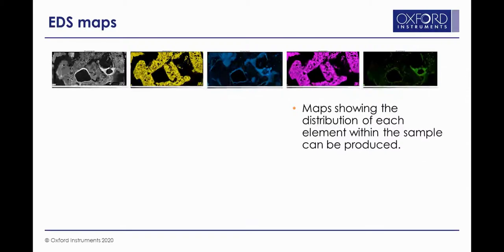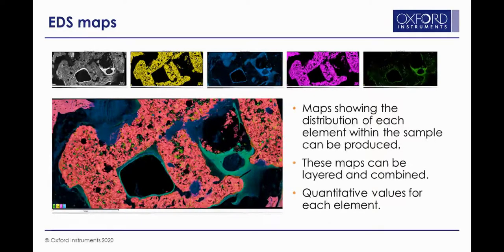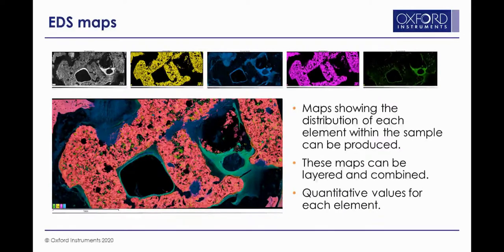We can convert this information into maps displaying the distribution of elements across the sample. Here's an example with several different maps — a lower magnification image of the example shown at the start of the presentation. You can see the relative different intensities of signal across the area being scanned. These individual maps each show the distribution of a single element, and they can be combined with the electron data to produce a multilayered map. Each image contains quantitative values for each element at each pixel position, allowing you to revisit the data and obtain quantitative values at any point within the software.